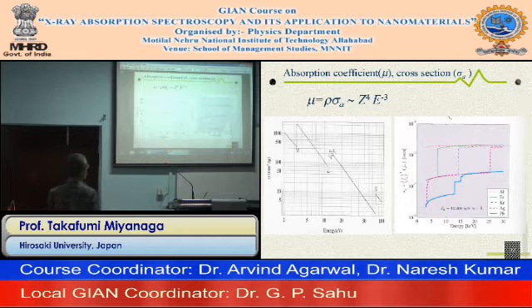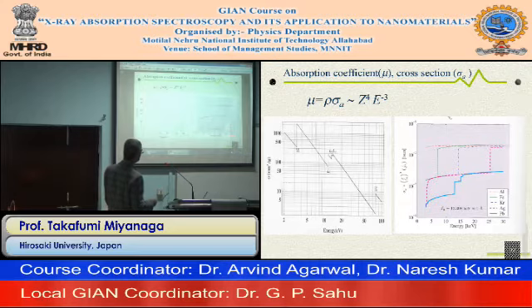This is an interesting demonstration of the experimental data. The cross-sections are normalized by the third power of energy and the minus fourth power of atomic number, for aluminum, iron, krypton, silver, and lead.